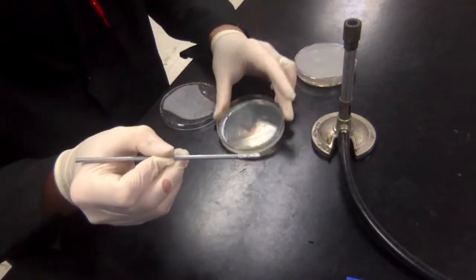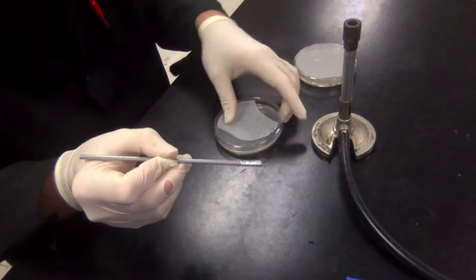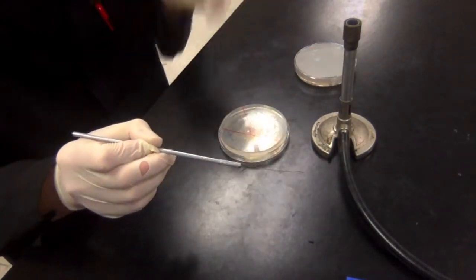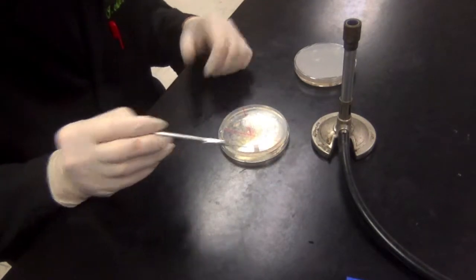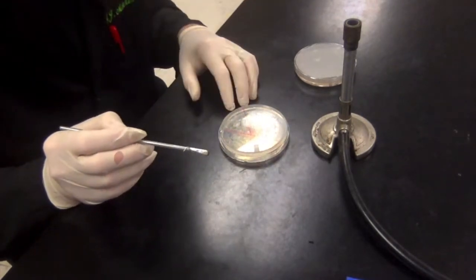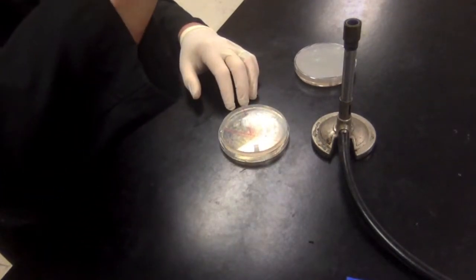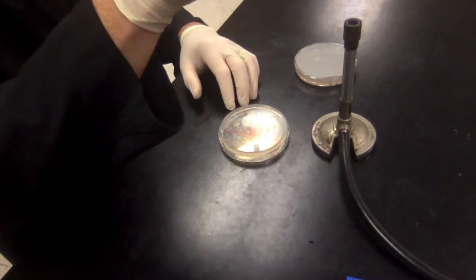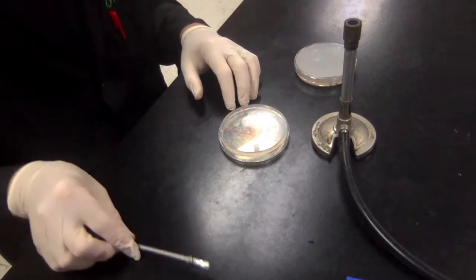As soon as I'm done with that last quadrant, I put the lid back on and flip it over so the agar is facing up and the lid is facing down. That way, when I incubate it, any condensation that forms will collect in the lid and I can shake it out. I'll flame the loop one last time to kill off anything remaining, and I'm done.